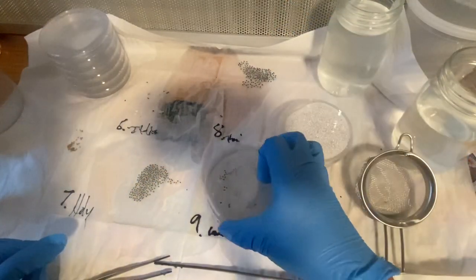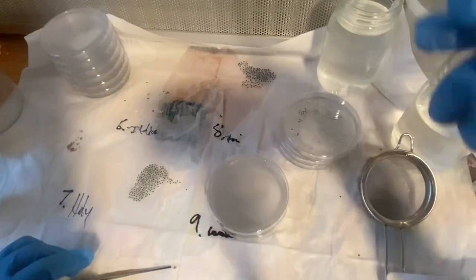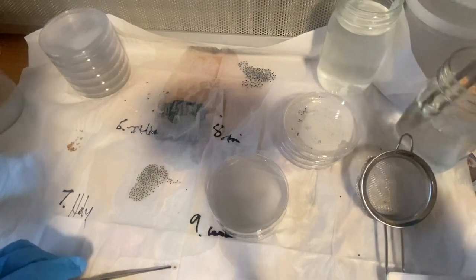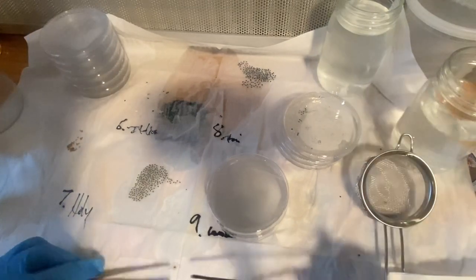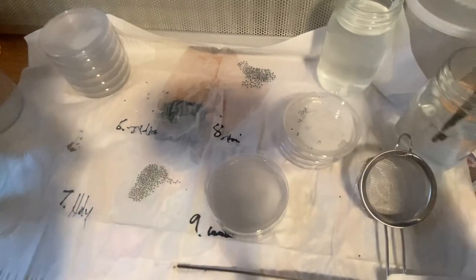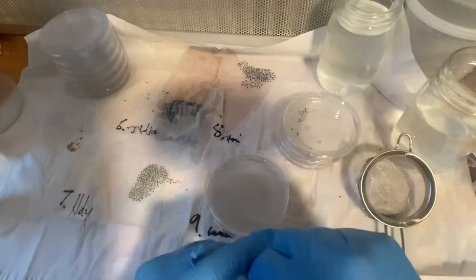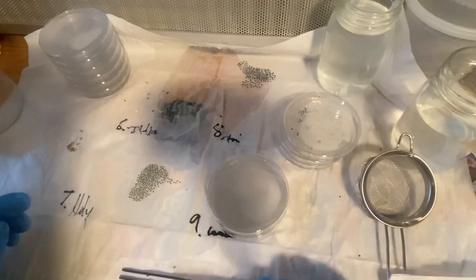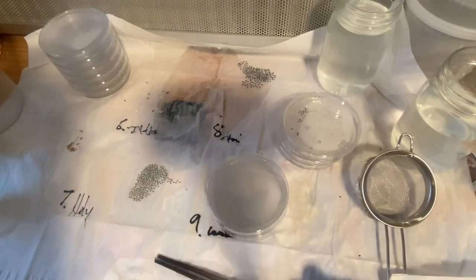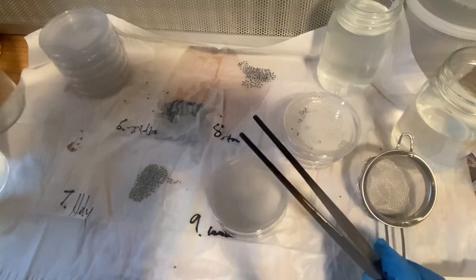Alright, I am gonna go ahead and clean my tools. And then I'm going to do the lavender induction. That way you can see me work a little bit quicker and a little bit more organized. I'm going to have to take my time with these basil seeds. So I'm just sterilizing my tools.